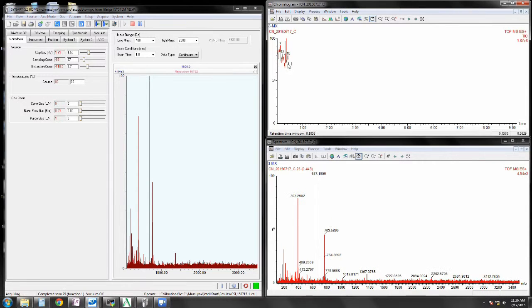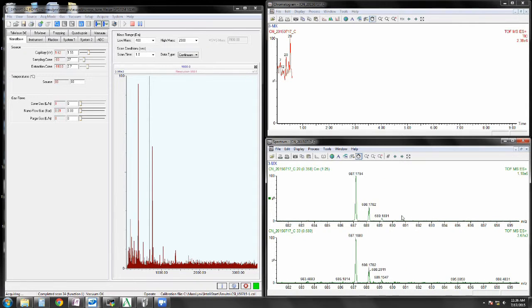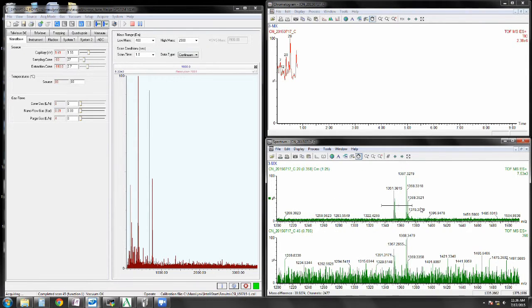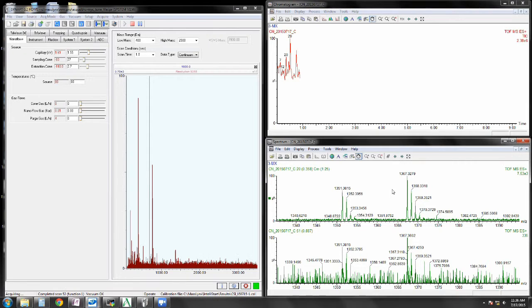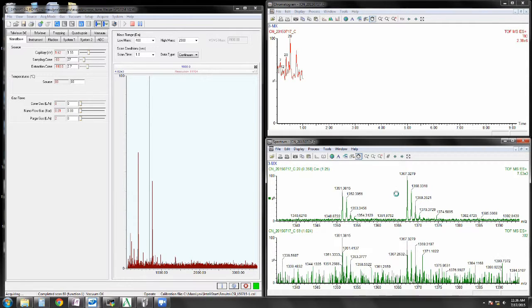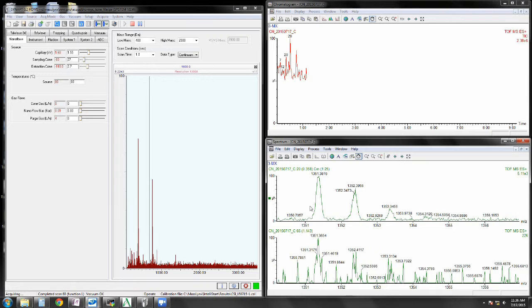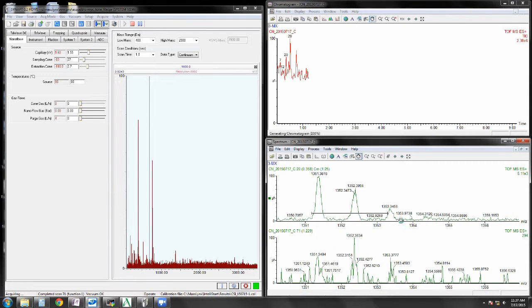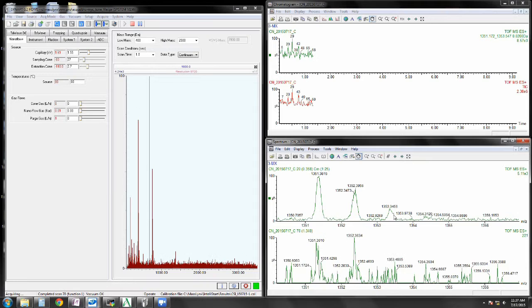We can do this by right clicking on the chromatogram and dragging across. You can now see a spectrum down here. And by zooming on the peaks with left click, we can see the isotope abundance ratio. This is the tetramer. And we can see from the separation here that we're dealing with a 1+ charge state. We can also zoom in here on the octamer and also see sodium adducts on your sample. Proteins and small molecules like to add sodium quite easily. It's very important in your sample preparation to remove all sources of sodium, but there will always be some around and it's commonly found in mass spec. You can also see where each ion has appeared in the chromatogram by zooming on the peak with left click and dragging across with the right click of your peak of interest. This is very important in LC experiments. You can see where each peak in your mass spec has come in the LC run.